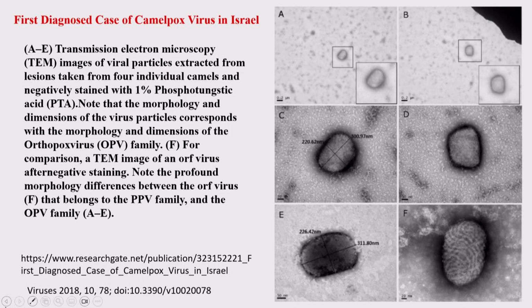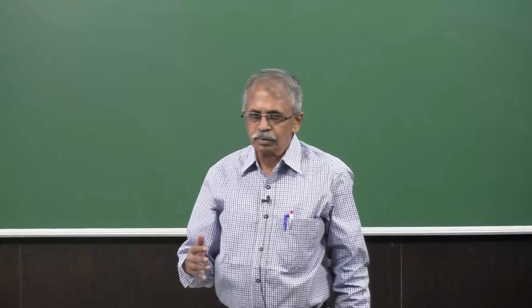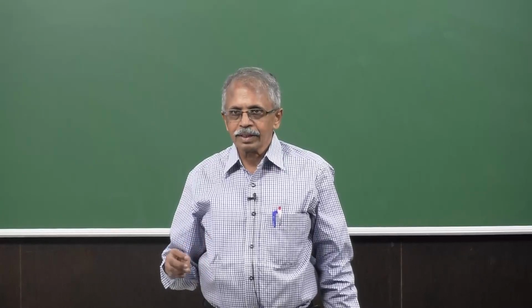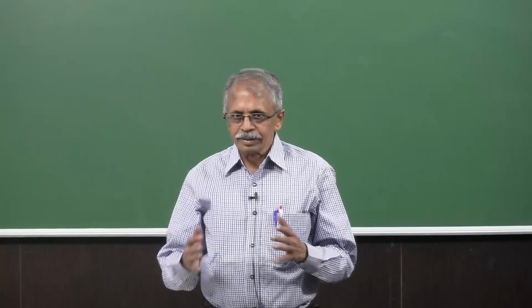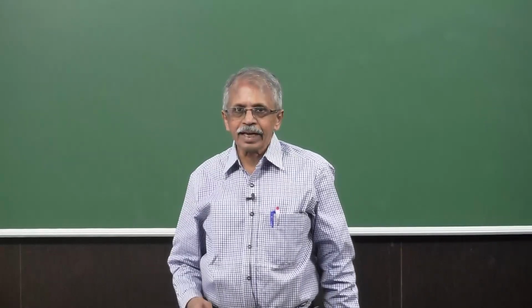Okay, so let us look at the last technique under this microscopy that I would like to cover. It is not really the last technique, but it is the last for this course, for this particular topic. And this is scanning electron microscopy.